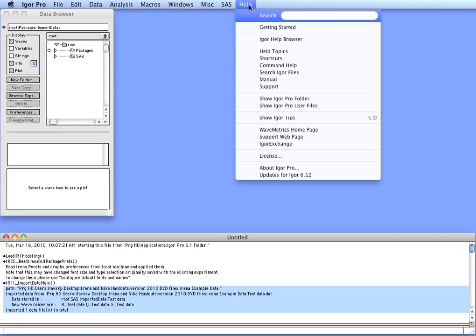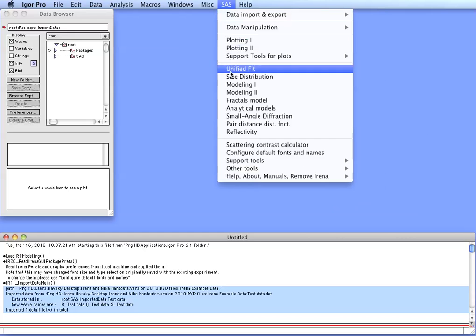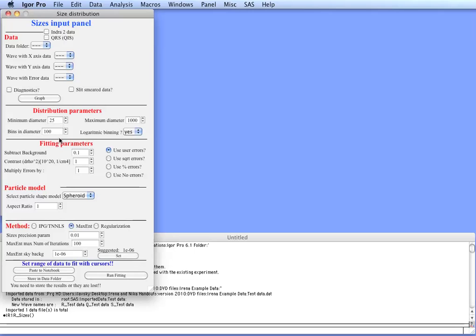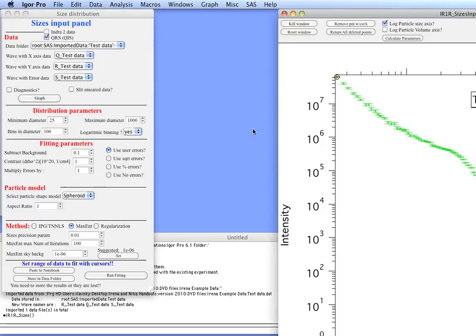We can close the associated windows. We can select a size distribution tool and get a new panel here. What we can do here is select that we have used QRS as naming structure, after which we now have access to the data folder we wanted. Automatically we get this filled with Q and S data: Q, Intensity, and Error. Hit graph.